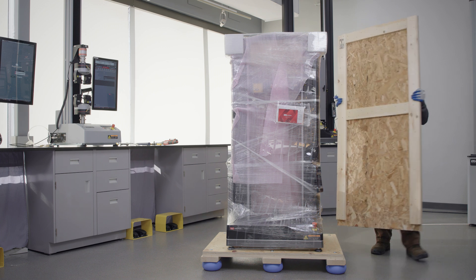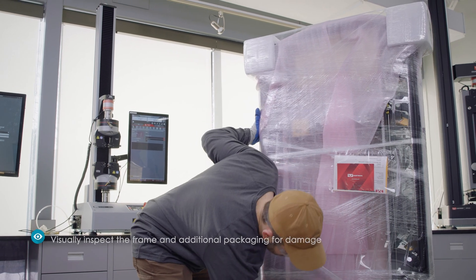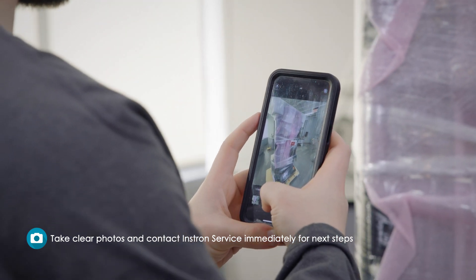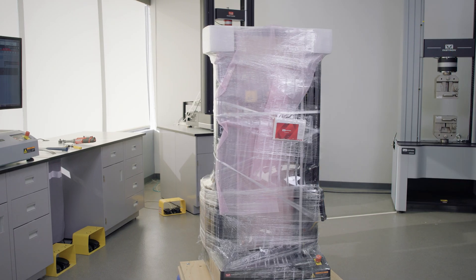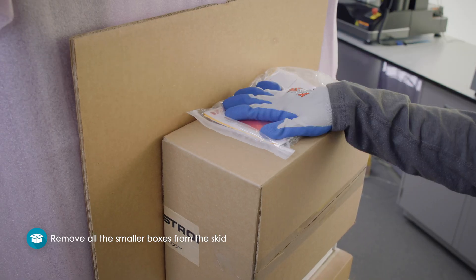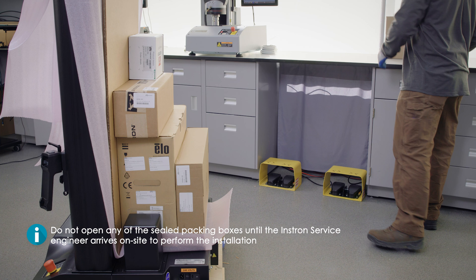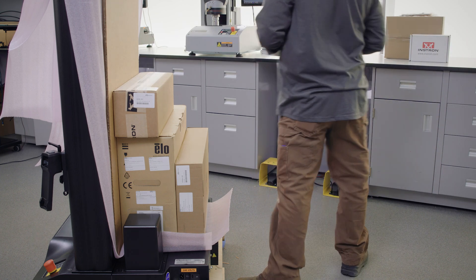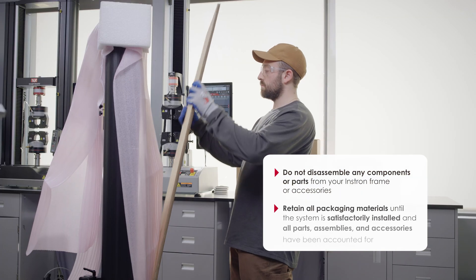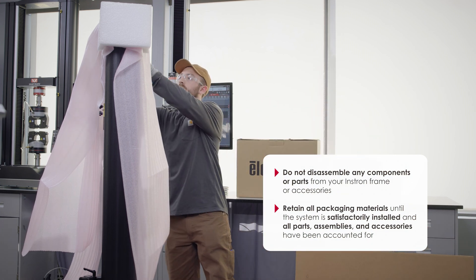Once the outer packaging has been removed, leave the testing system on the skid and visually inspect the frame and additional packaging for any damage. If you notice any damage, take clear photos and contact Instron service immediately for next steps. Even if there is no visual damage, we still recommend taking clear photos from all four sides, then proceed to remove all the smaller boxes from the skid. Please do not open any of the sealed packing boxes until the Instron service engineer arrives on site to perform the installation. Do not disassemble any components or parts from your Instron frame or accessories, and retain all packaging materials until the system is satisfactorily installed and all parts, assemblies, and accessories have been accounted for.